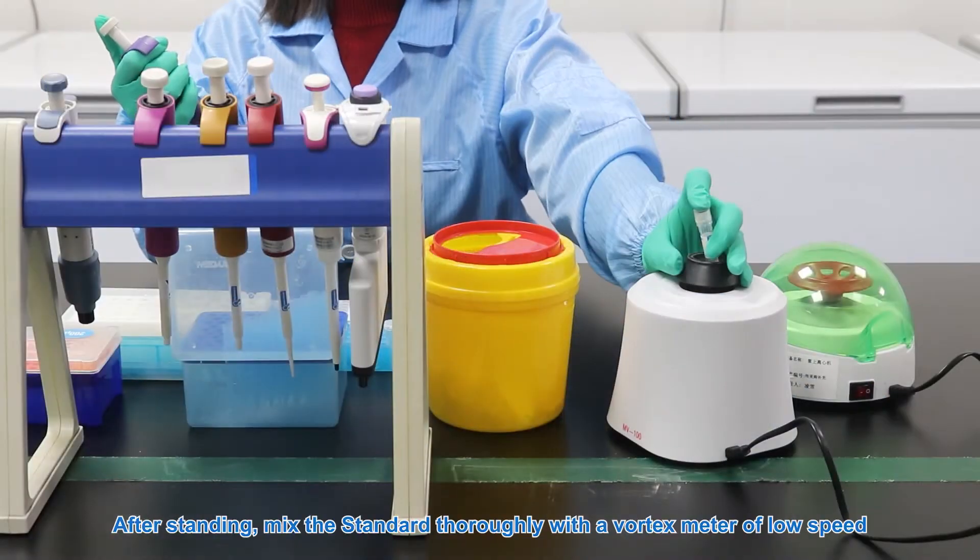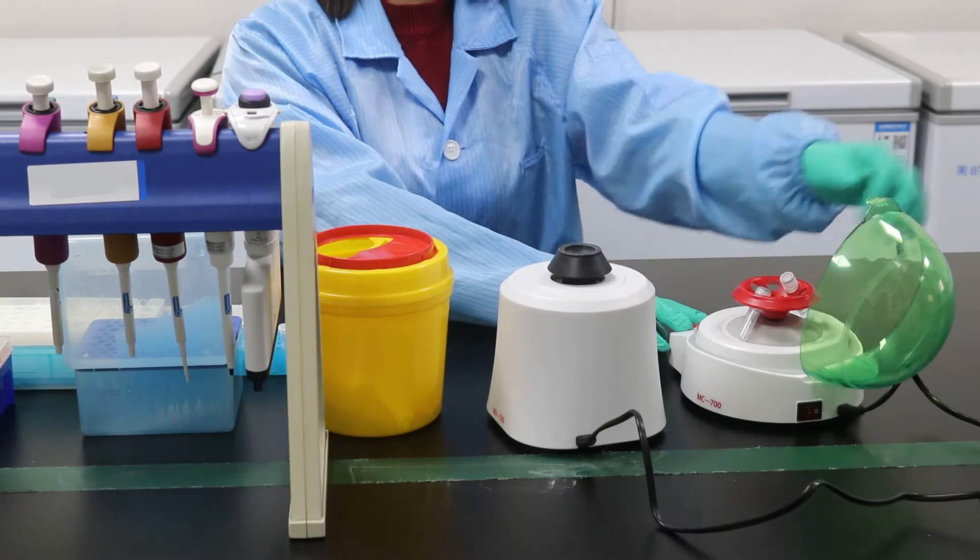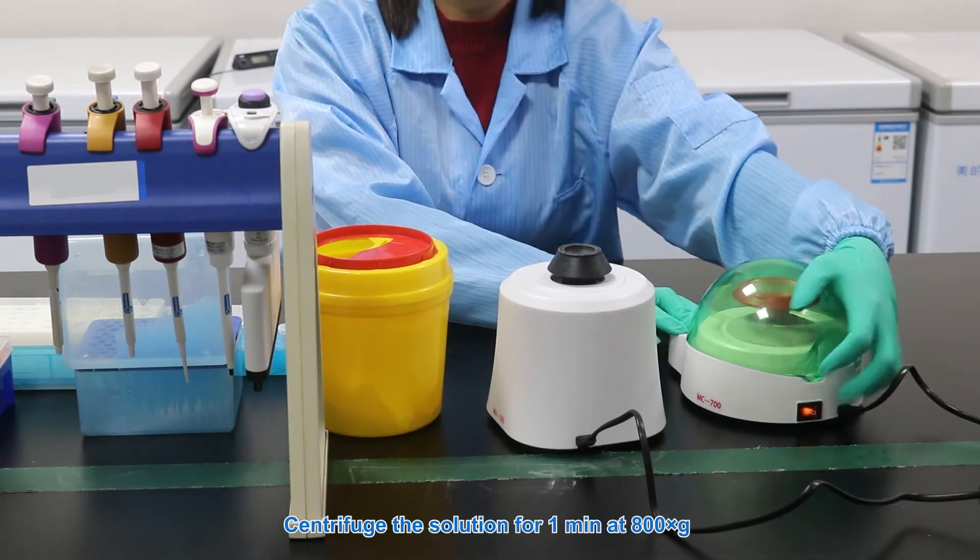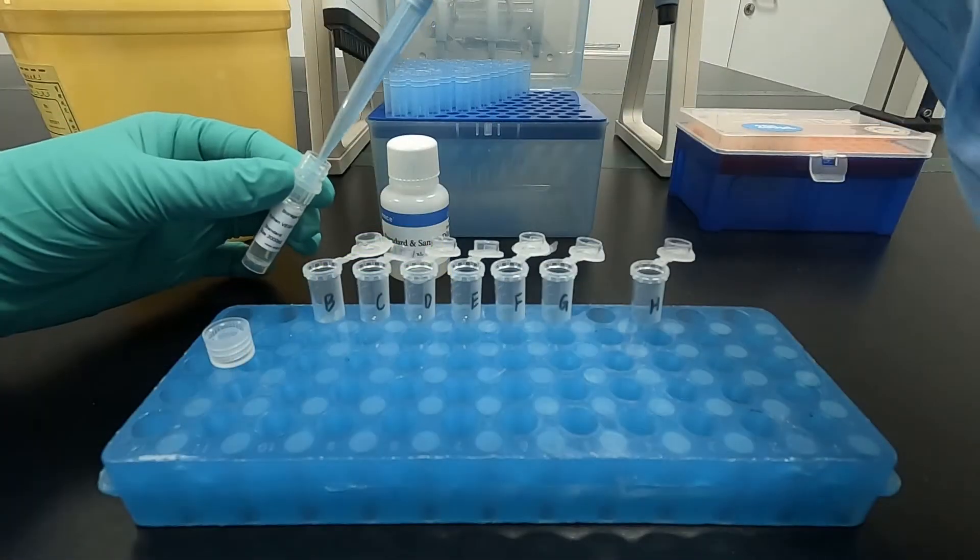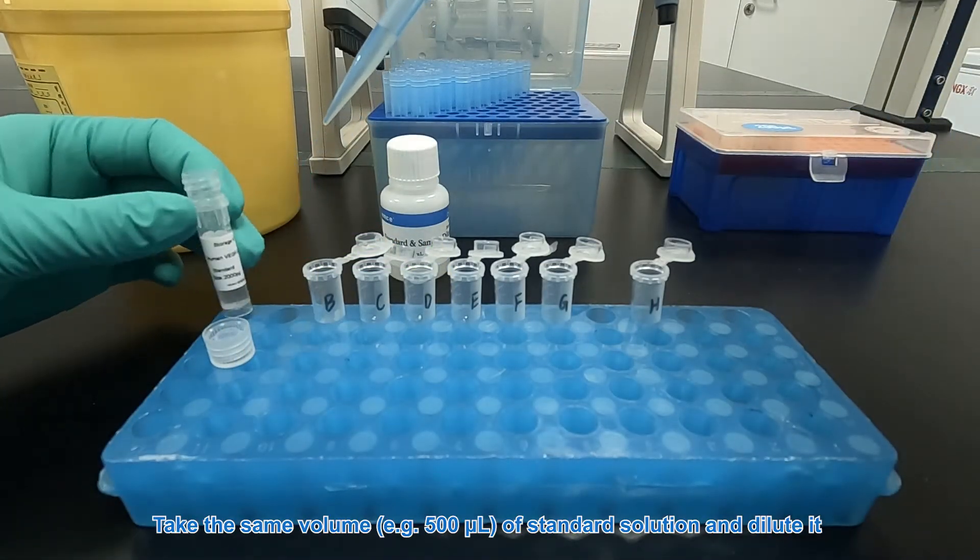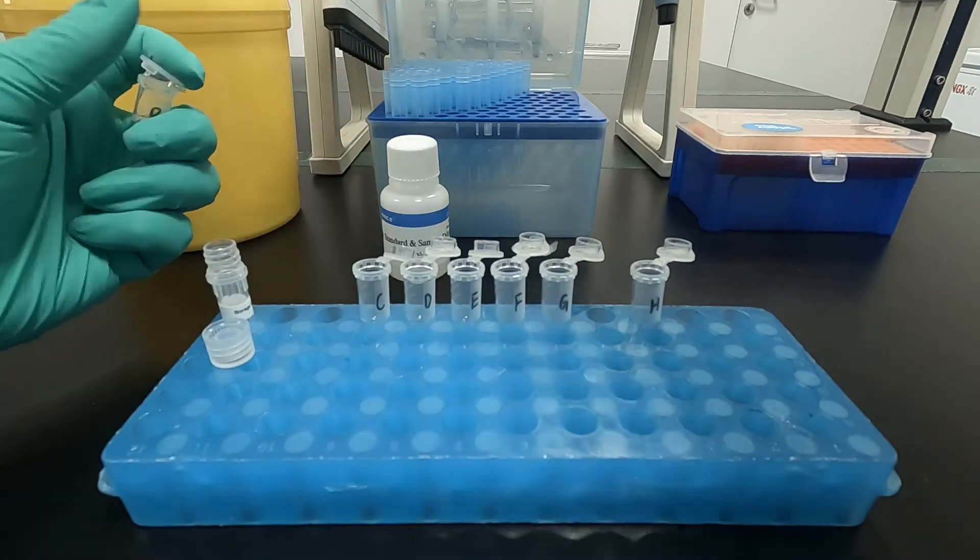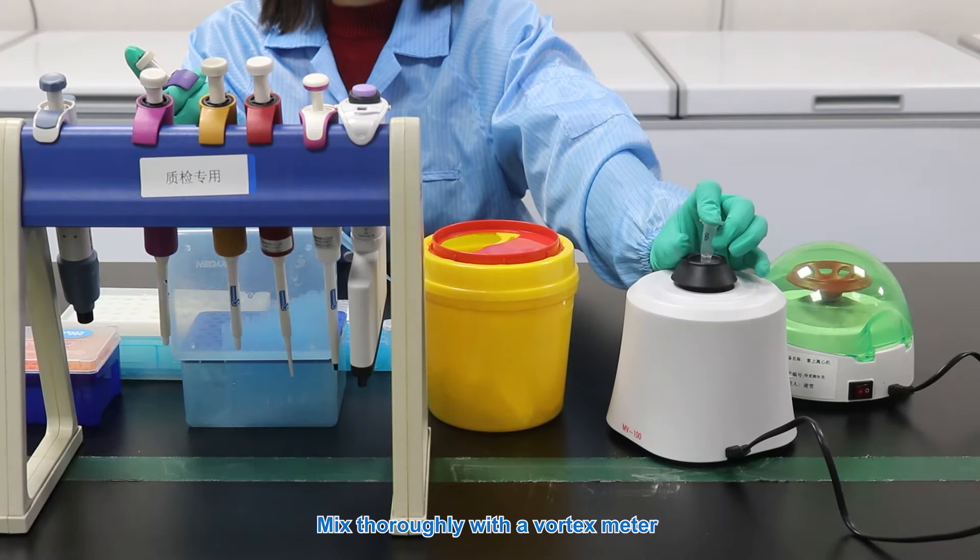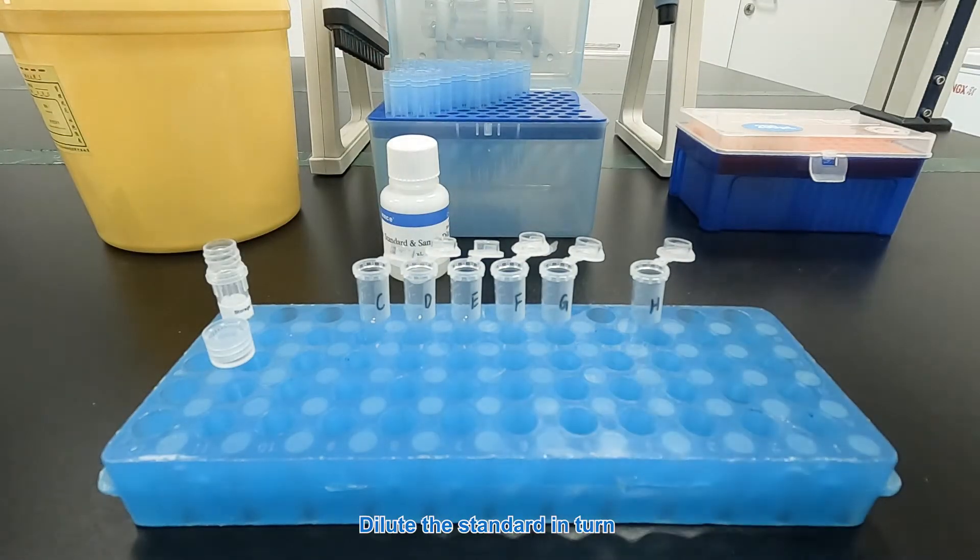After standing, mix the standard thoroughly with a vortex meter at low speed. Centrifuge the solution for 1 minute at 800 G. Take the same volume of the standard solution and dilute it. Mix thoroughly with a vortex meter. Dilute the standard in turn.